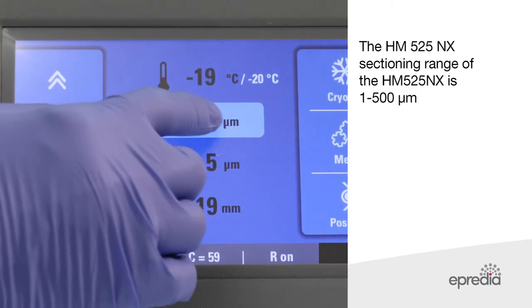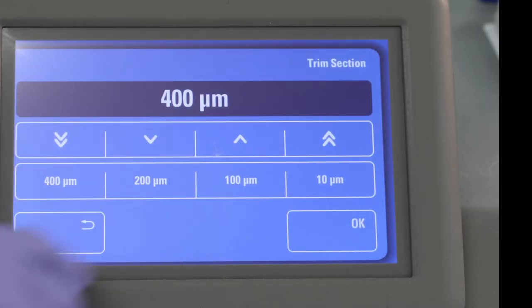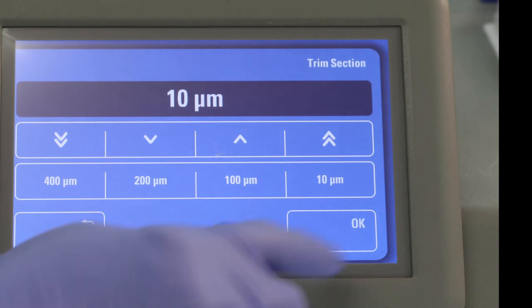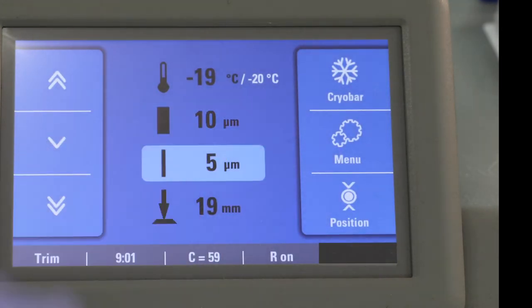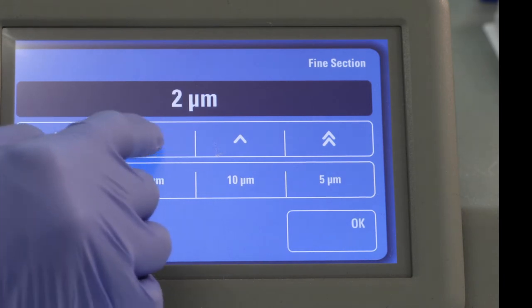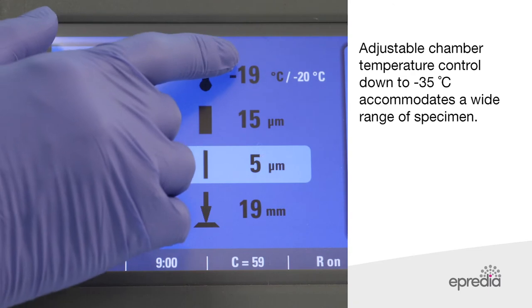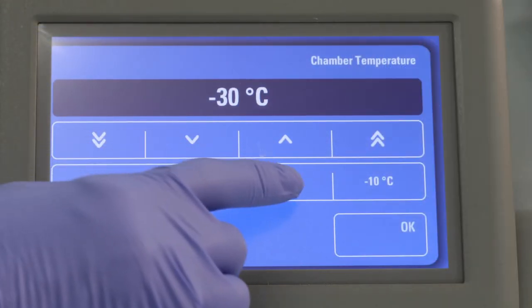The sectioning range of the HM525NX is 1 to 500 micrometres. Adjustable chamber temperature control down to minus 35 degrees Celsius accommodates a wide range of specimens.